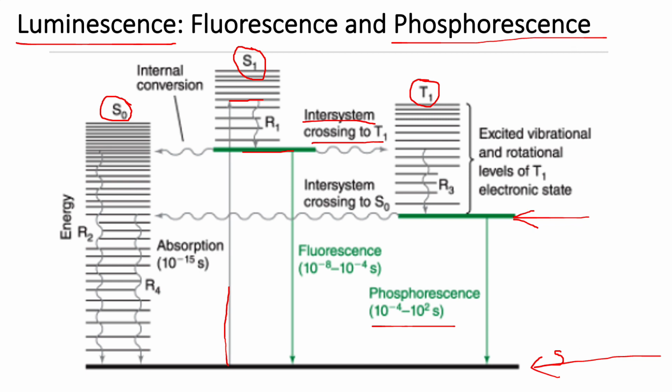Okay, what else can we say about this? Fluorescence can be very sensitive, making a measurement like this. And the reason is the way the spectrometer works. We were talking before about absorption, for instance. In absorption, you're sending in a lot of light, and then you're looking for a small decrease in that amount of light, which is difficult to measure. You're sending in so many photons per second or so many watts of light in, and you're looking for a small decrease.